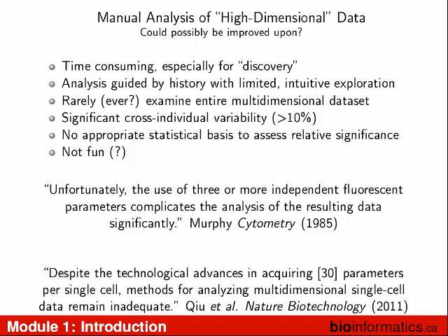So when you're doing diagnosis, it's not that hard to do the flow cytometry gating because you can follow the gating hierarchy right to that population. So intuitively, it's not so bad. Where it gets to be a bit of a pain is that it can be time consuming, especially when you have a lot of sample variation. And you may not want to do that. You may have other things you'd like to do in your life other than gating. So the idea is you can have the computers find those cell populations in the same way that you had found them, with the same variation. And so you can do the more interesting things, perhaps, that's science.